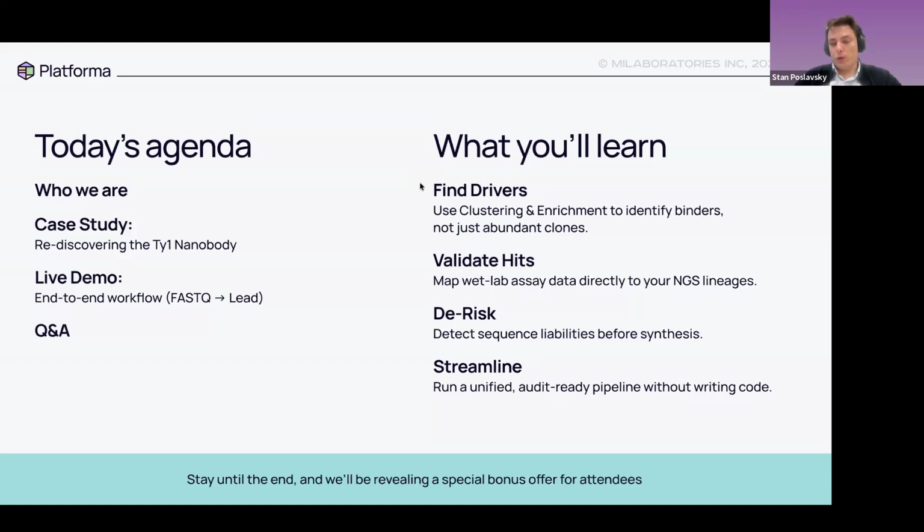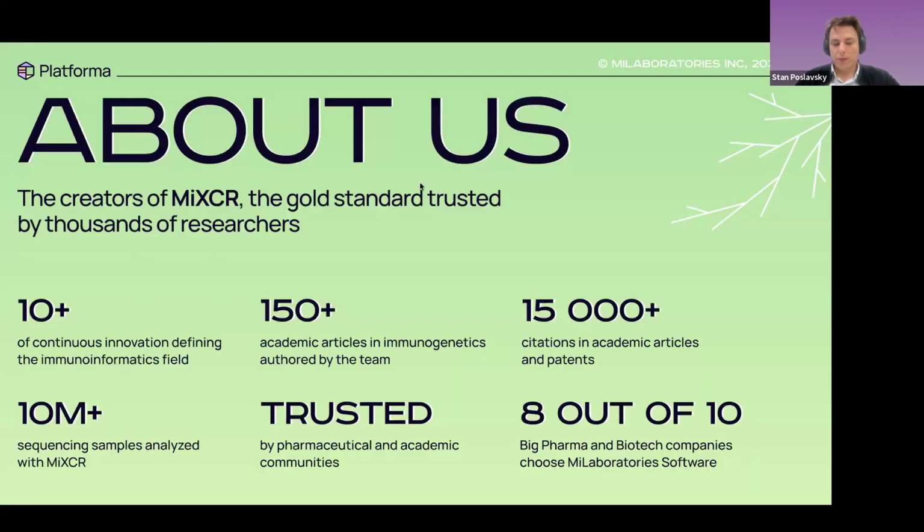Yeah, so what we will be doing today, we'll be doing a live demo with a case study of VHH antibody discovery with phage display. To start with, let me introduce ourselves, who we are, what's our company, and why we are doing this.